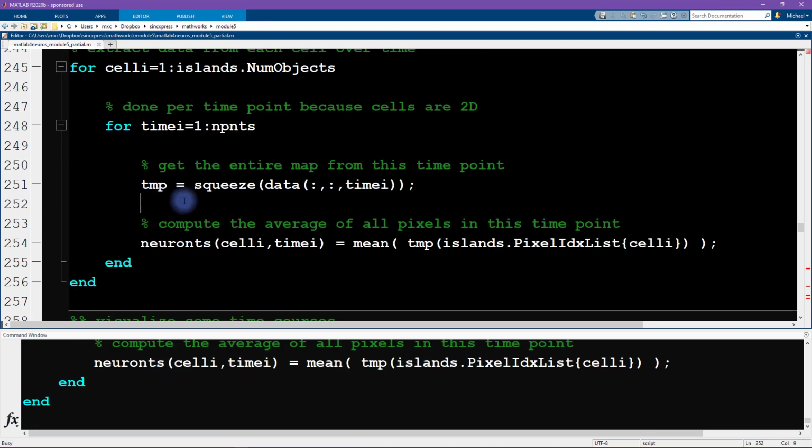So a few videos ago, we transformed the original data green, remember that was the cell array, to this data matrix data. And I mentioned in that video that sometimes transforming data from one variable type to another, in this case it was transforming from a cell array into a numerical matrix, that can facilitate some analyses. It might make other analyses a little bit more cumbersome or a little bit more annoying. And we actually see 2 examples of that here in this module. So transforming the data from a cell array into a matrix actually facilitated the image processing that we applied in the past several videos. So it made the processing easier.